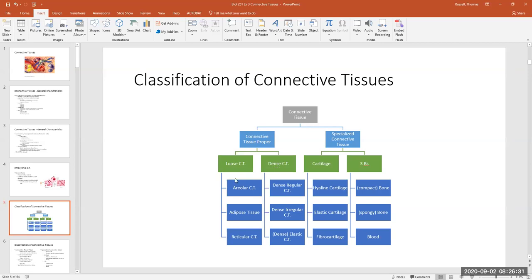In loose connective tissues, the fibers are there but kind of all over the place. In dense connective tissues, they're stacked together very tightly. When studying, you should know that adipose tissue is considered a loose connective tissue, and that dense irregular connective tissue is a dense connective tissue, and so forth.